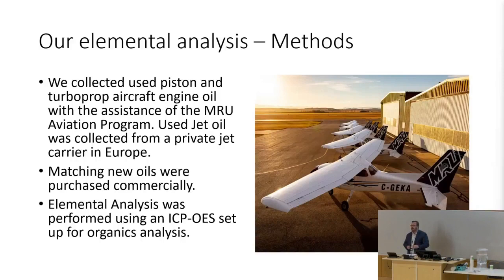Used jet oils are incredibly hard to come by. We were able to source a few from a business jet company out of Europe. If anyone has an in, please let me know at some point during this conference. I desperately need more samples. But we were able to do that. We sourced these samples and injected them into an ICP-OES, or inductively coupled plasma optical emission spectrometer. Anyway, we put it in and took a look at the results.